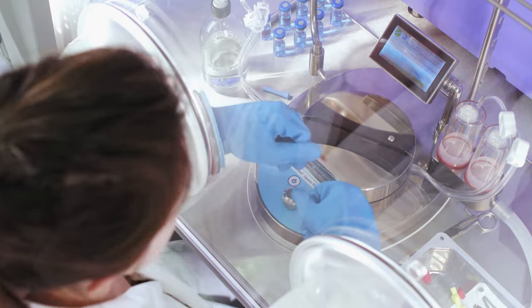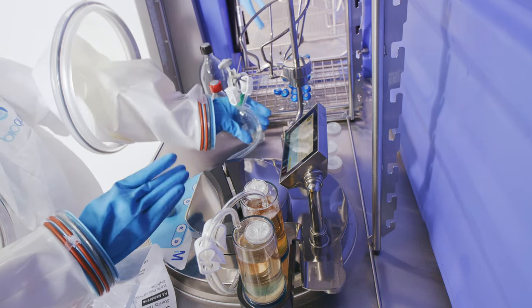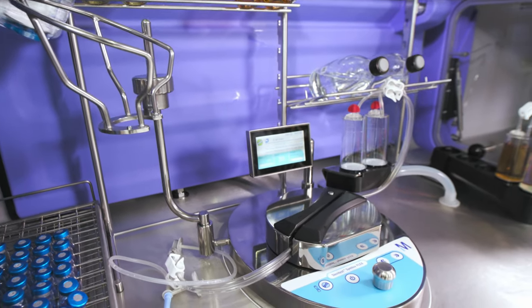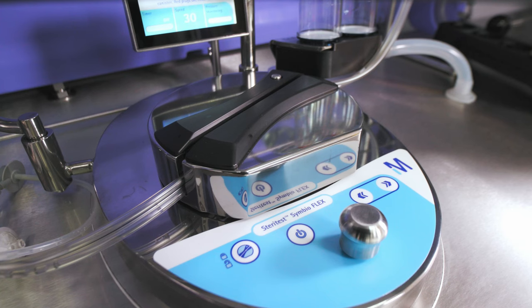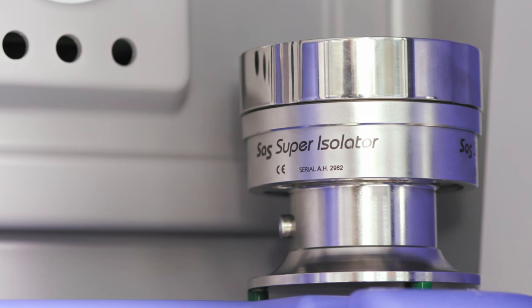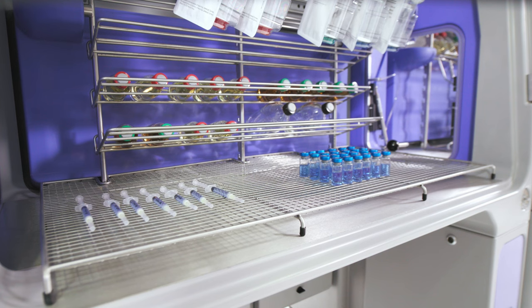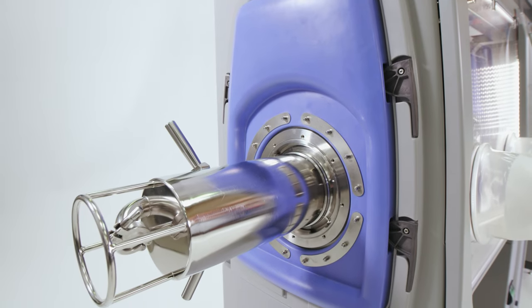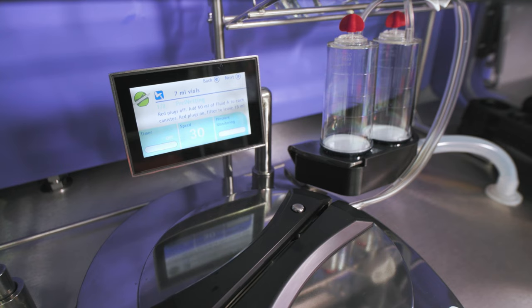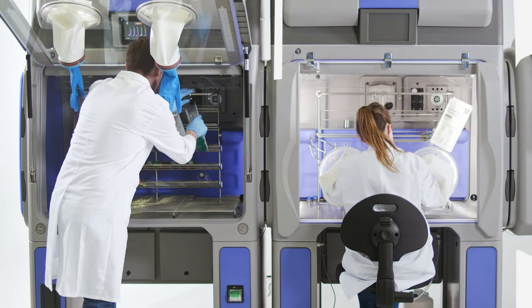The flexibility of the BioQuell Cube doesn't stop at its modular capability and hydrogen peroxide vapor technology. It also offers seamless integration options such as incorporating the world's leading sterility test pump from Merck Millipore, four options of environmental monitoring to suit your needs, complete racking solutions for various load configurations of supplies, rapid transfer port, integrated screen and camera for recording and displaying worksheets, an easy-to-use glove integrity test system, and safe sort prescription towers.